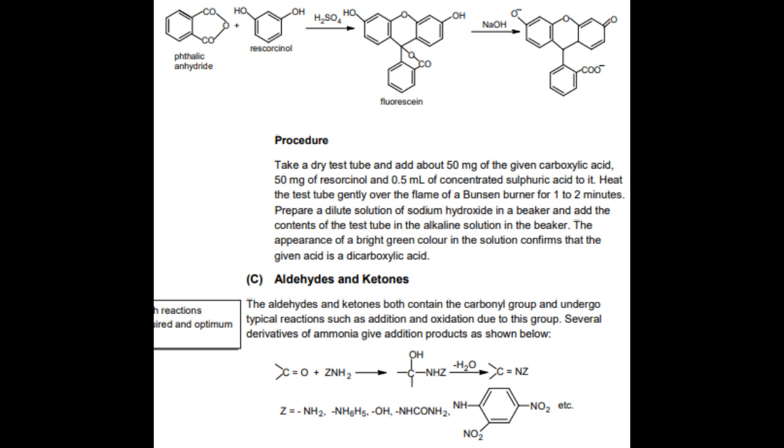1. Brady's test, reaction with 2,4-dinitrophenylhydrazine. Both aldehydes and ketones on reaction with 2,4-dinitrophenylhydrazine give yellow to orange colored solid 2,4-dinitrophenylhydrazone.